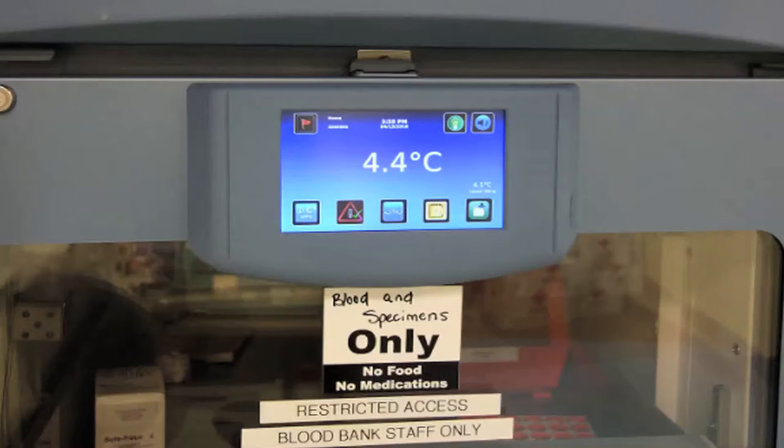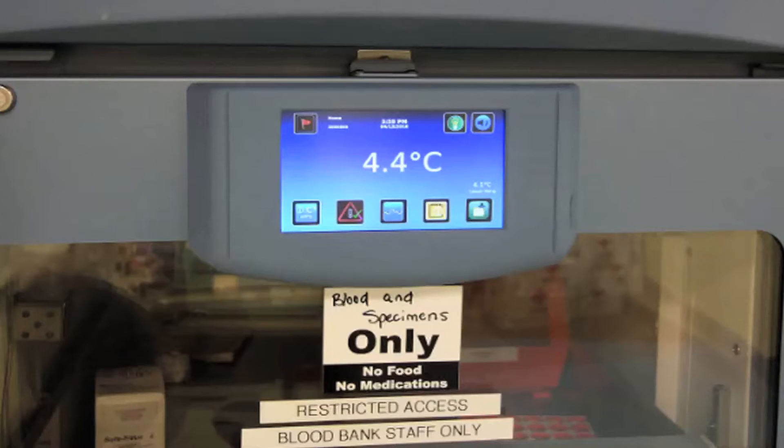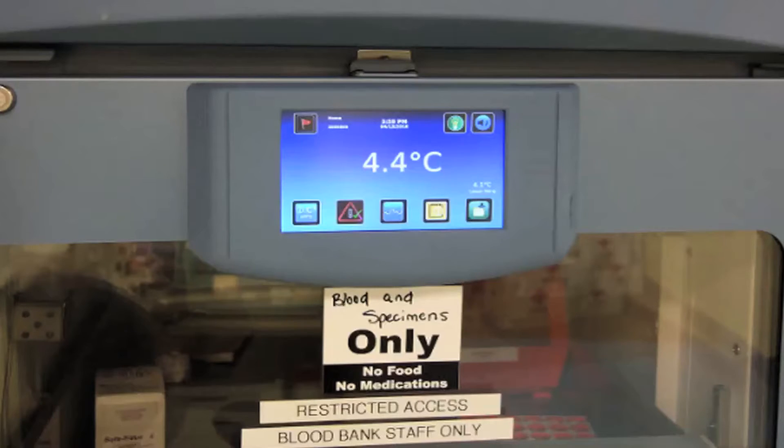As part of good lab practice and regulations, a lab must keep track of this temperature, and whenever it is out of the desired range, the lab must ensure that a proper documented corrective action is done.